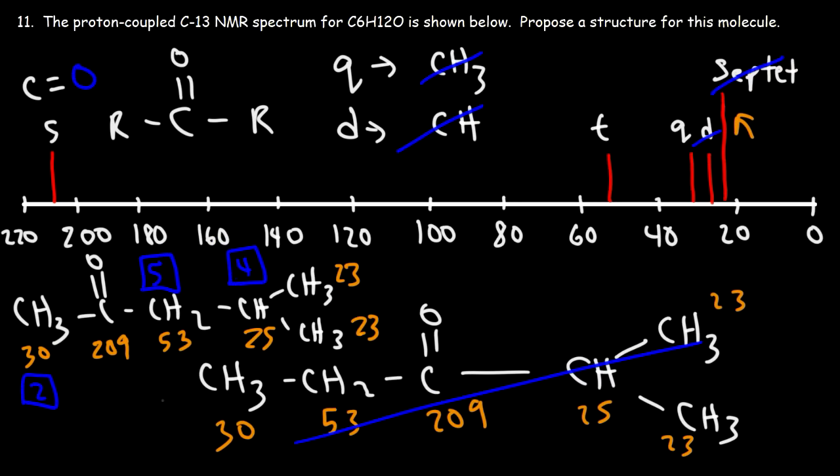So now we can see why the methylene group is much higher than the methine group. For one reason, this is next to the carbonyl group and the methine group is not. So that's one reason why this is higher than this one. The second reason is that it has a higher score. So there's two factors favoring the high chemical shift of the CH2 group.